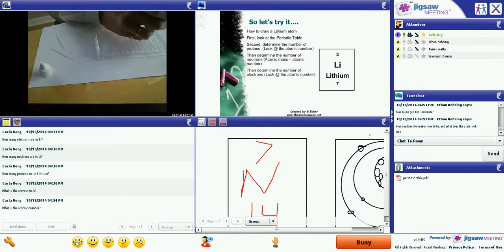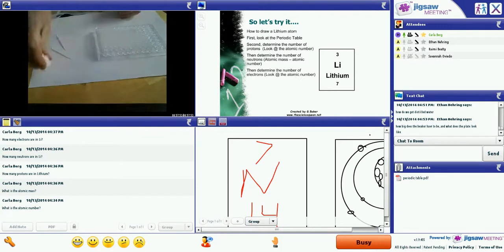And 5 drops to E1. When you are doing labs, it is very important that you follow and put the right number of drops in the correct well plates. Otherwise, none of the lab is going to line up correctly.